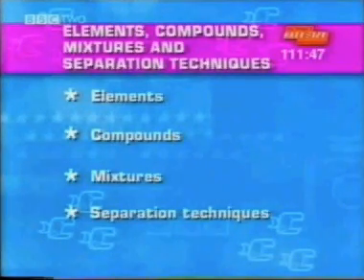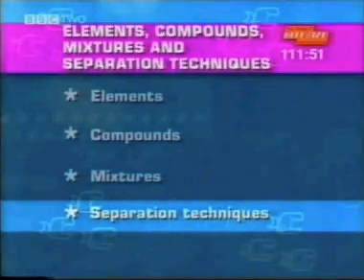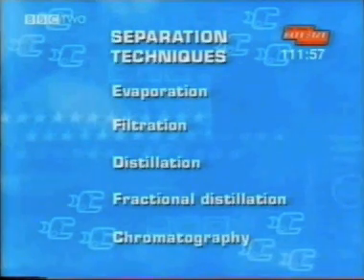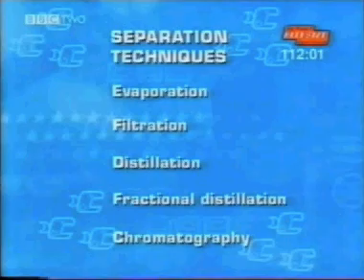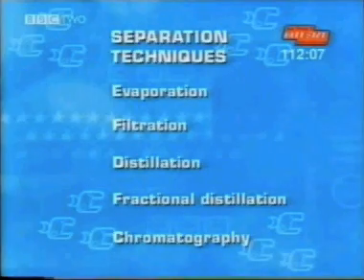In chemistry, mixtures often need to be separated, and in the next section we're going to look at the separation techniques. There are 5 different separation techniques you need to know for your test, and also when you would need to use each one. In this next clip, several different separation techniques are used to separate salt out from rock salt. Try writing down all the ones you see.